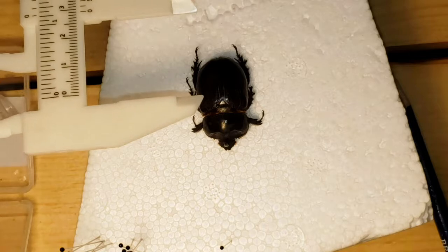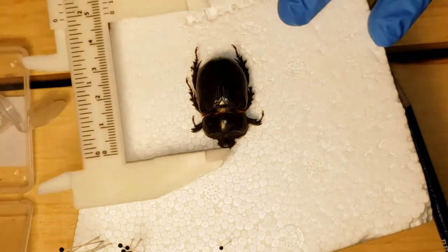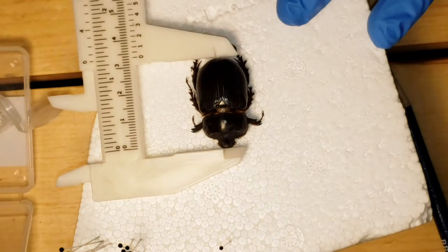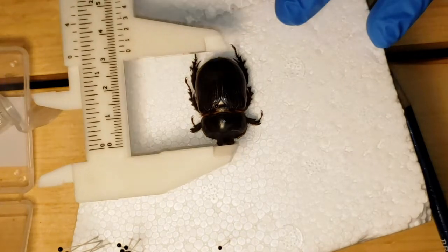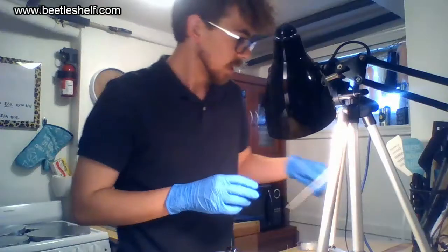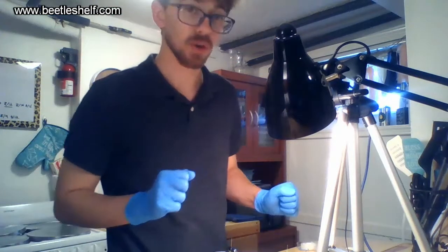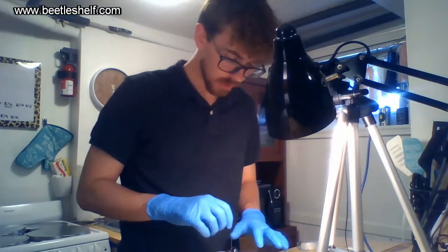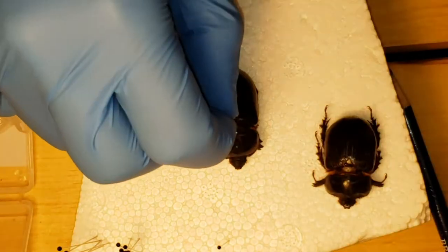These calipers you can just buy on Amazon, they're pretty cheap — just get plastic ones, you're fine. This male is about 31 millimeters. These things can range anywhere from 25 to 36 millimeters, so he's right in the middle, pretty average. Let's move him over and check out the female.